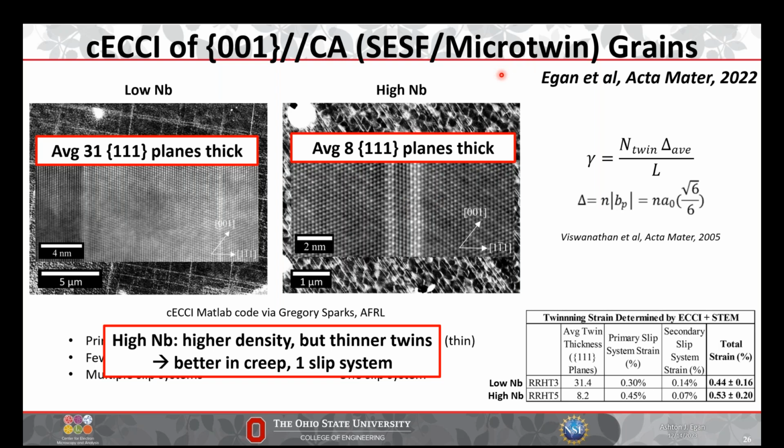I just take basically a quick EBSD scan and have Euler angles, but this can be very powerful information if you use it correctly. And that's sort of the takeaway from these first two cases, right? It's not anything too fancy, but it's very practical, and this is how we can use EBSD sort of in our everyday research lives to make things easier and solve problems.